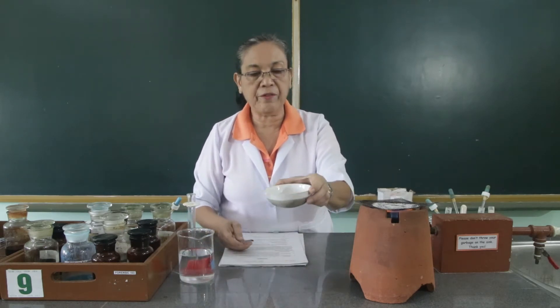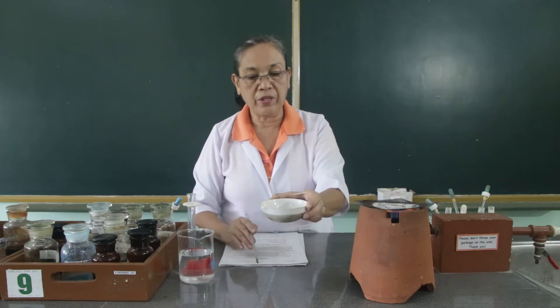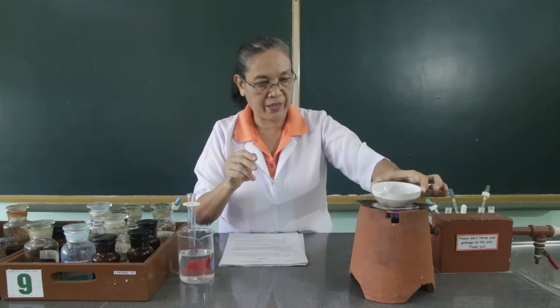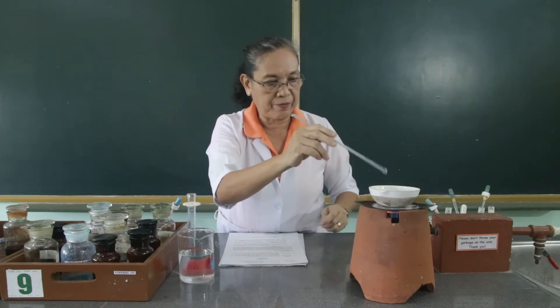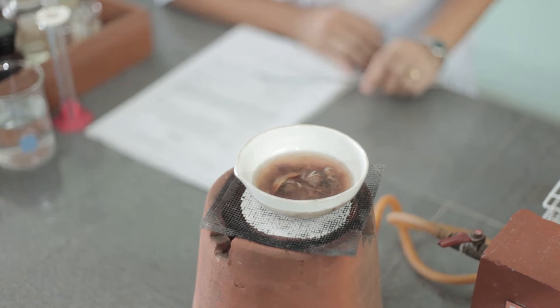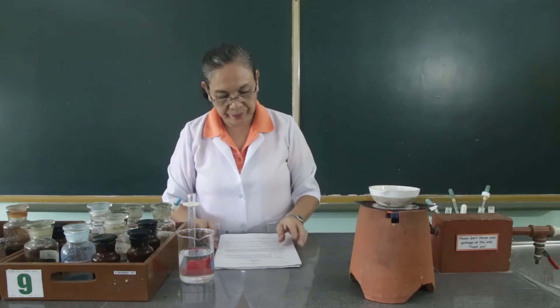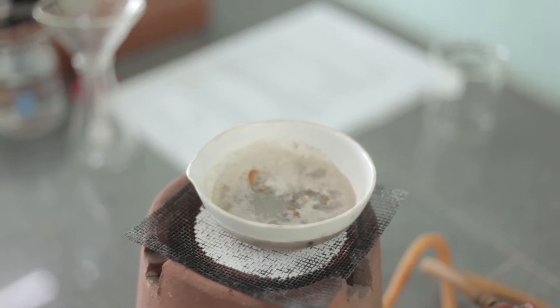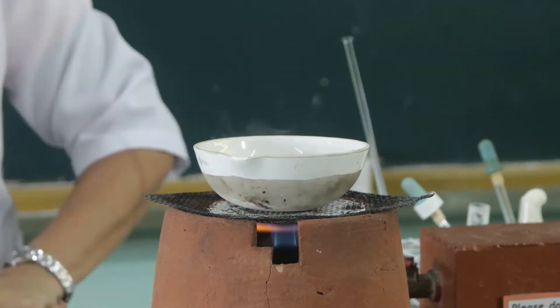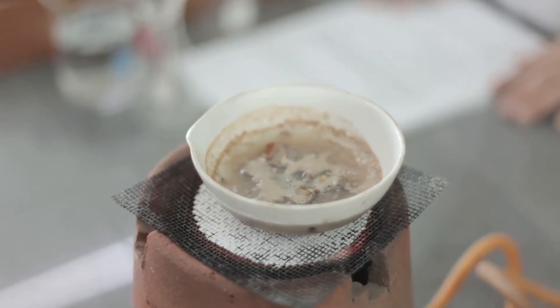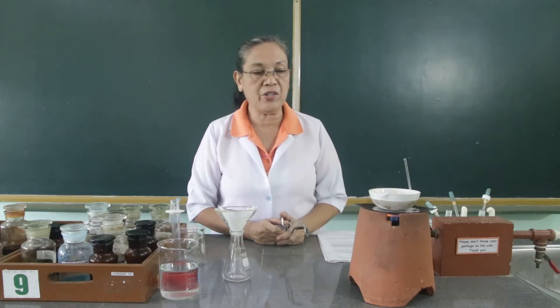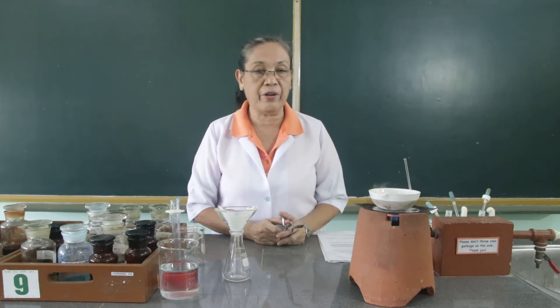So I have already added 40 ml of water into the ground shellfish meat. We have already boiled the meat of the seashells with water for 20 minutes, then the next step is we are going to filter this.